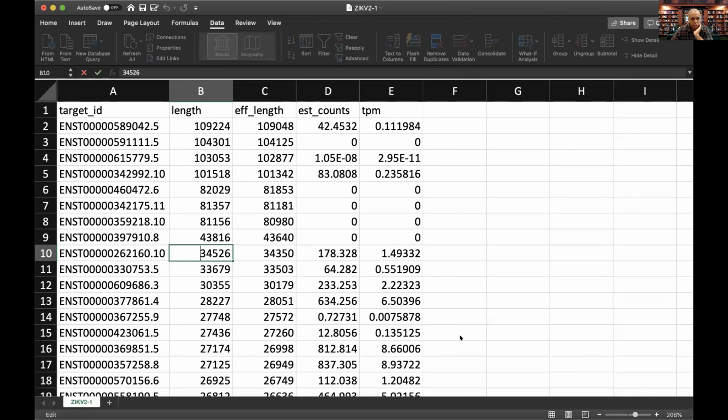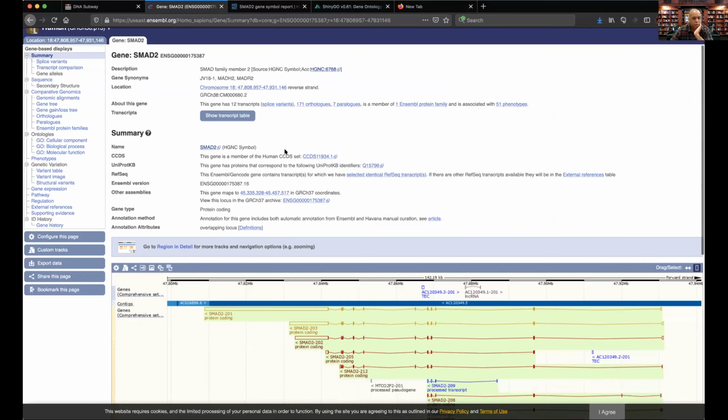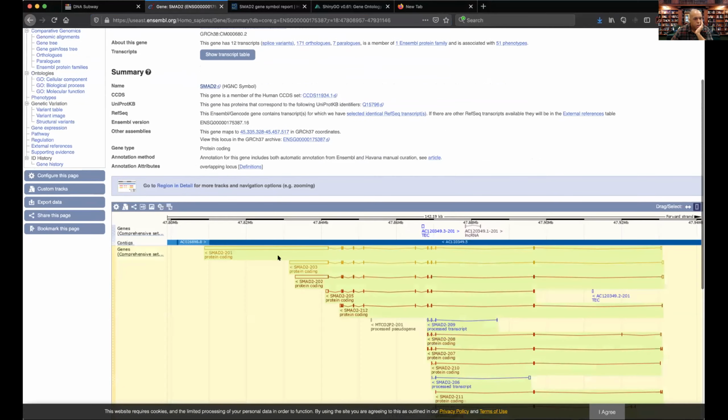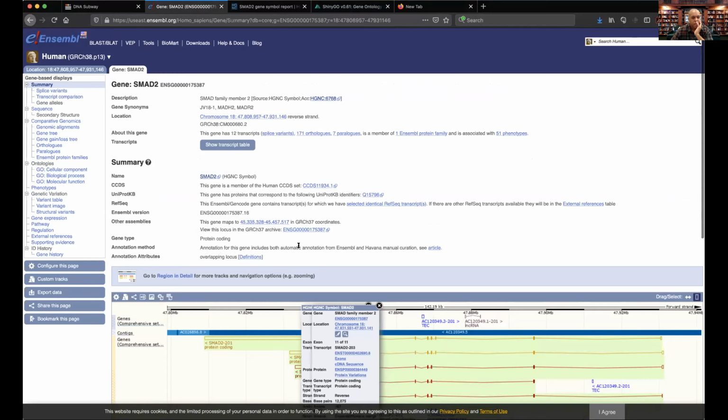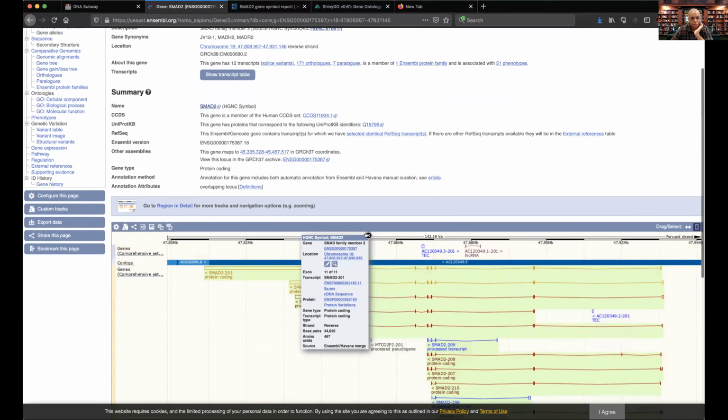And if I go back to my web browser and I'm looking at it, it doesn't give me the count there. But by eye, well, that's one of them. These are different isoforms, so there's different versions of this gene, which are probably alternatively spliced. I was just looking to see if it gave me quickly. Yeah, that smaller one was 12,000, and yeah, 34,000. So all of these things are lining up the way that we would imagine. Okay.